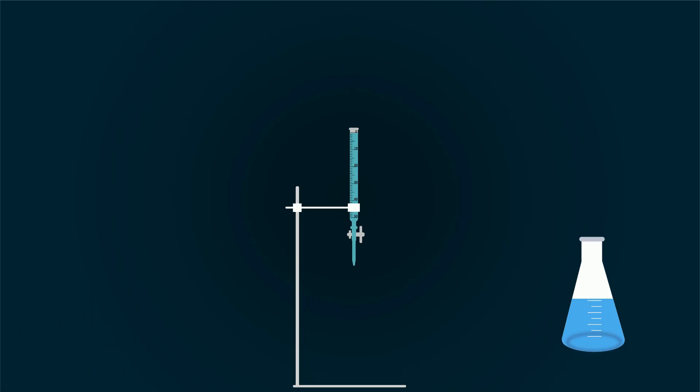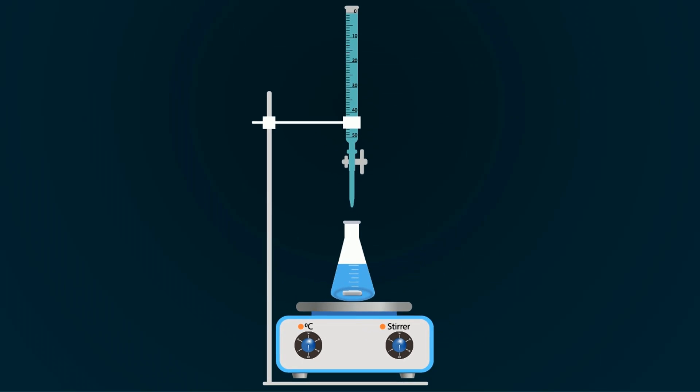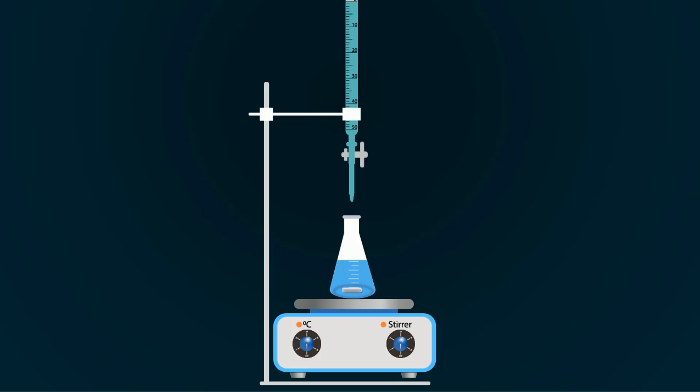Now put magnetic stirrer and add magnetic bar into the conical flask. Now put this conical flask on the magnetic stirrer and power it on, so the magnetic bar starts rotating.